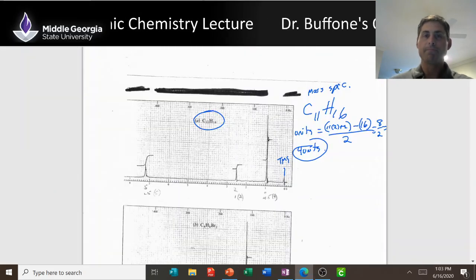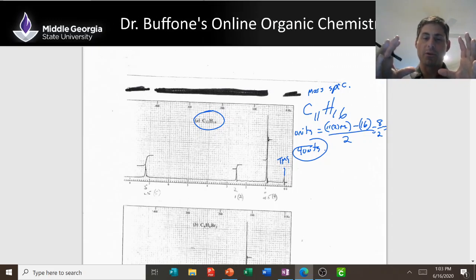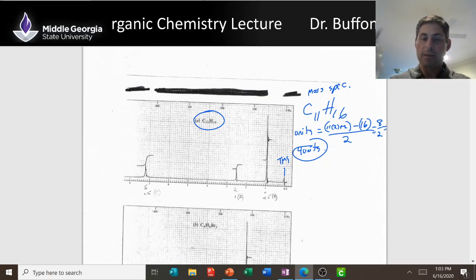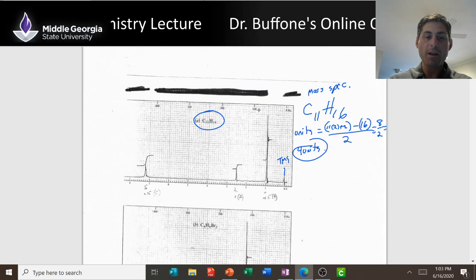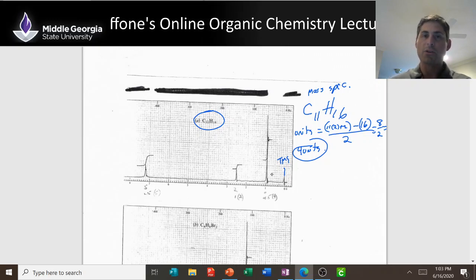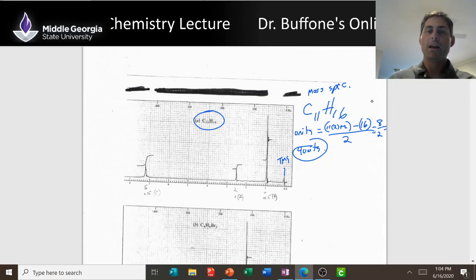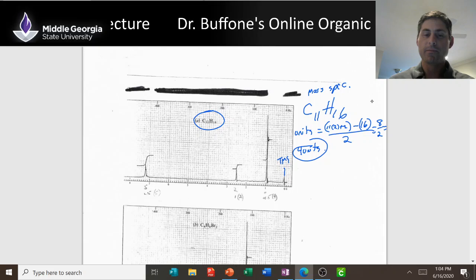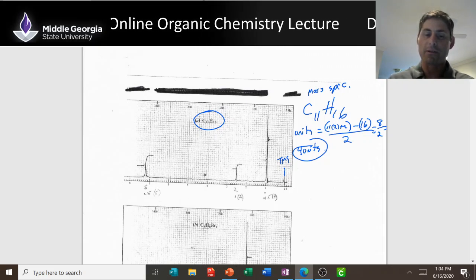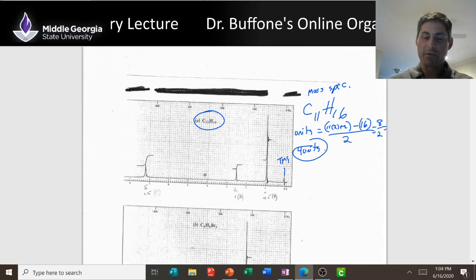And then out pops an NMR spectrum. You see this first on the NMR on the computer screen. Then you can print this out and then take it wherever, or you can just keep it on a computer and save it there. But this NMR spectrum has signals that you can use to interpret and get the actual structure of your molecule. It is also very important that you have the molecular formula, because it's going to be really hard to get the structure without the molecular formula. So molecular formula is very important.